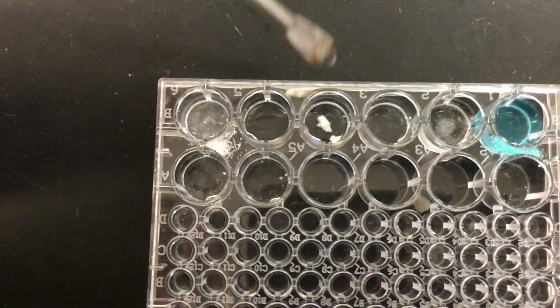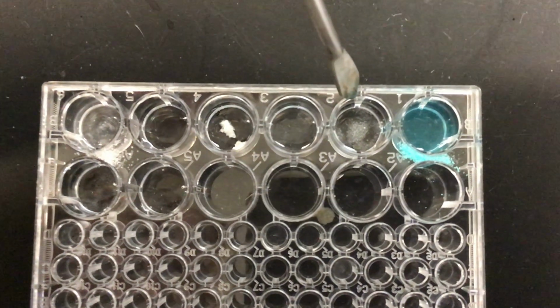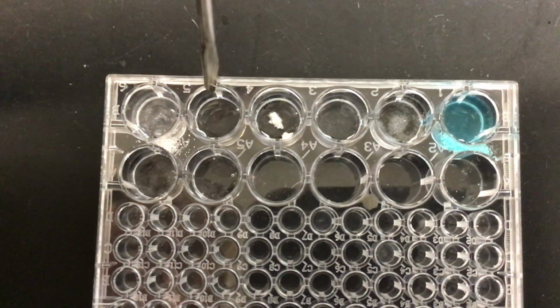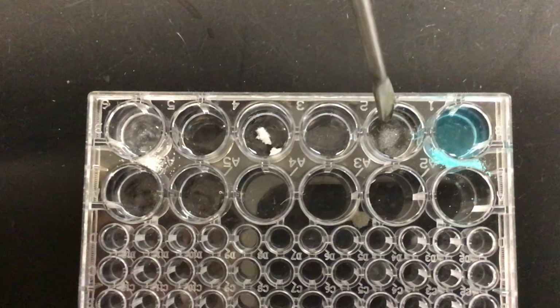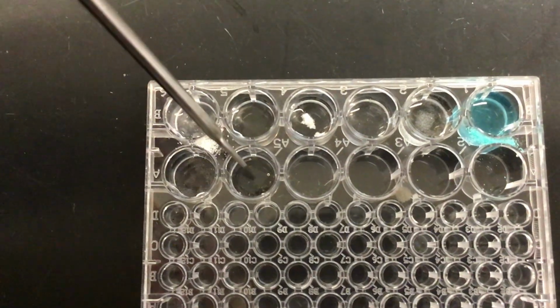Number 2 dissolved. 4, nothing happened. 5, it dissolved. 6, partially dissolved. Oh wait, no, so 1 yes, 2 yes, 3 yes, 4 yes, 5 so-so, 6, the copper chloride did dissolve, 7 yes, and 8 yes.